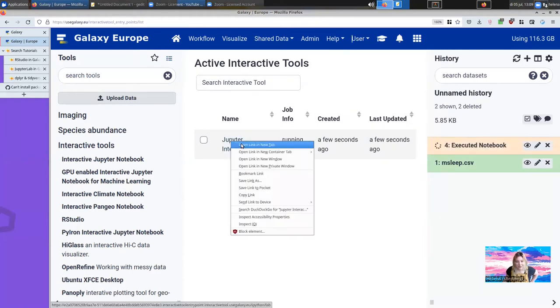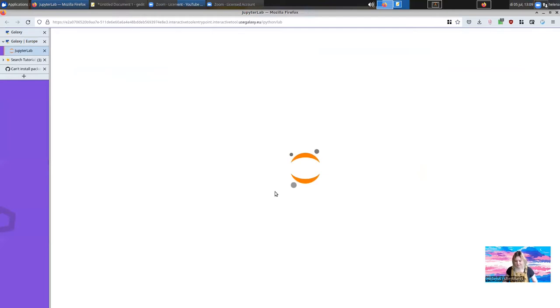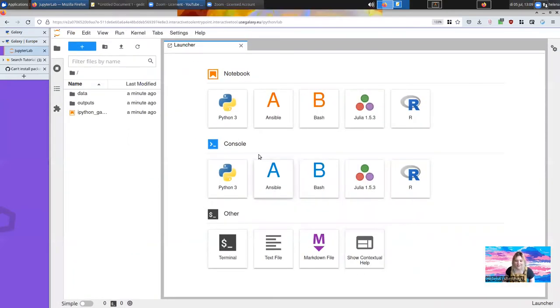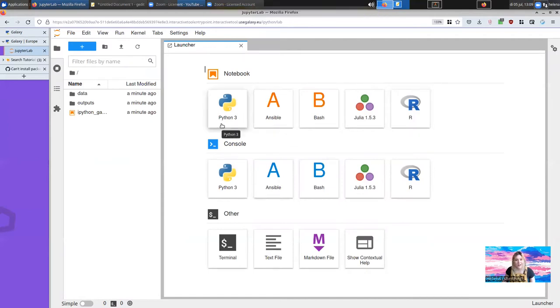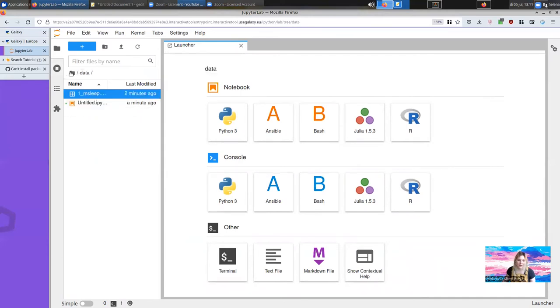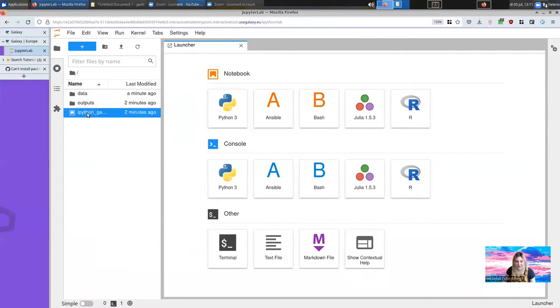Let's open it in a new tab. Here we can see the Jupyter interface load. We have access to a lot of different kernels that we can use if you'd like to use the Python 3 kernel to analyze your data or even an R kernel. All of that's available. In your home here you have access to a default notebook. Let's go ahead and open that now.